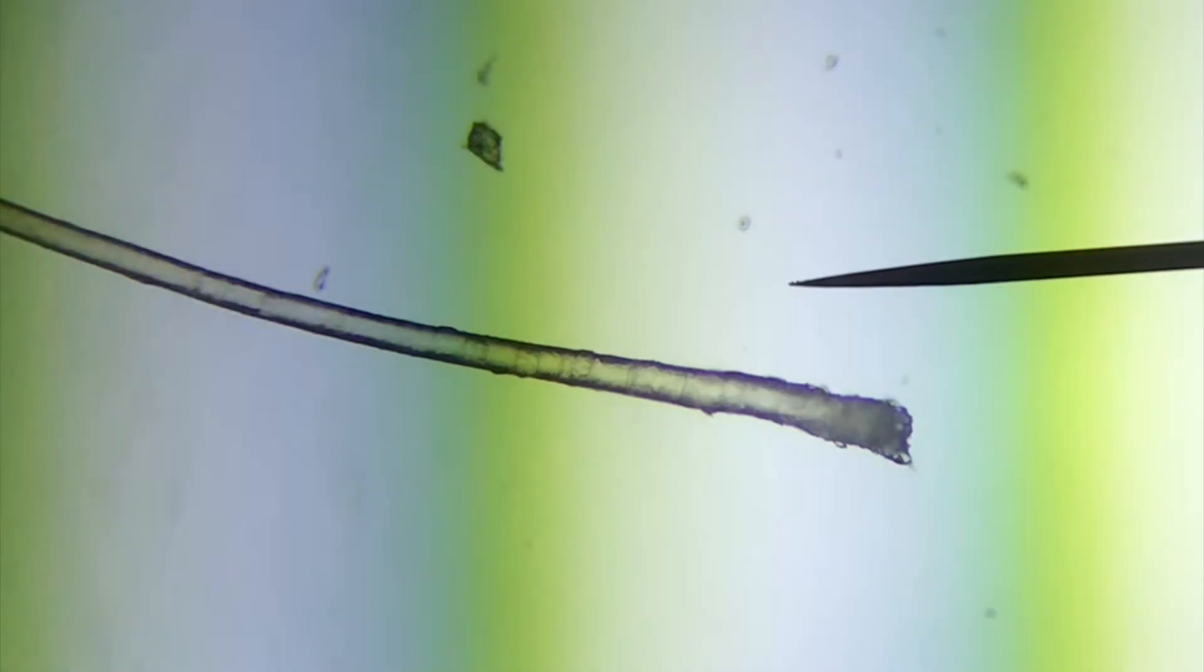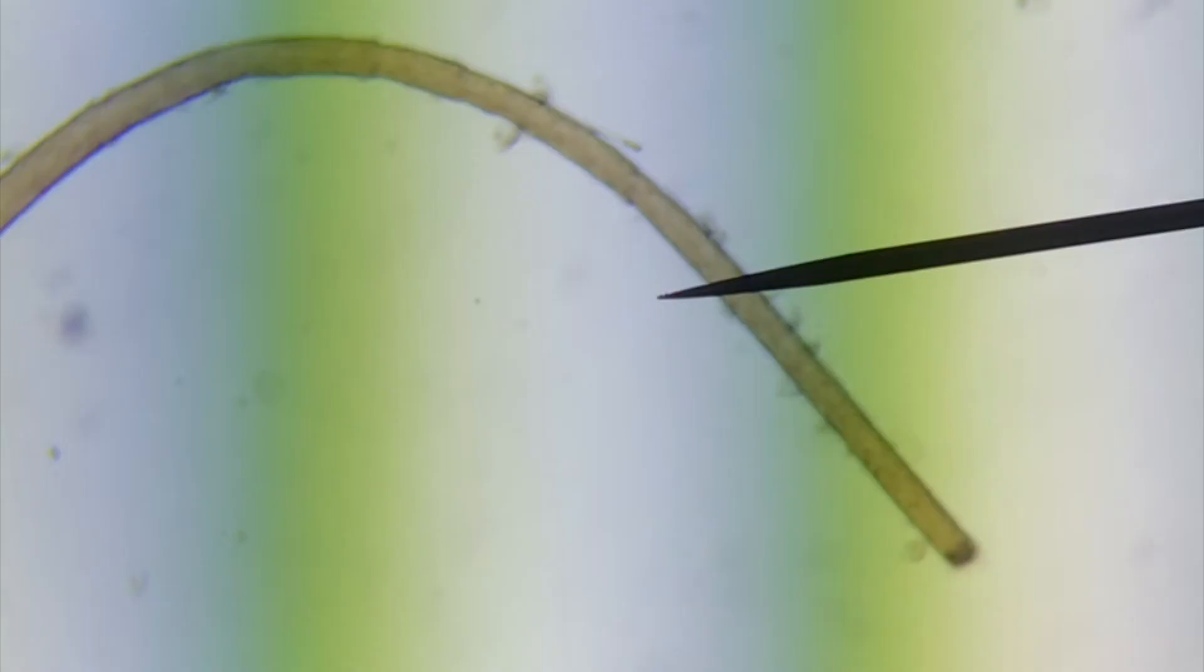All right so this is a strand of hair from my arm. You can see the end of it has the follicle. There's not nearly as much follicle tissue on this one. It was a little bit more difficult for me to pull it out with the follicle intact. But here you can see the end of the hair strand. Notice how it's a nice blunt end. There's more color deposited into this strand and you can compare it to the purple from my hair here.